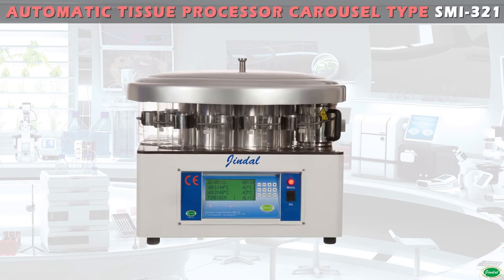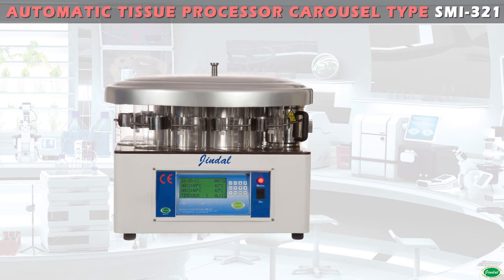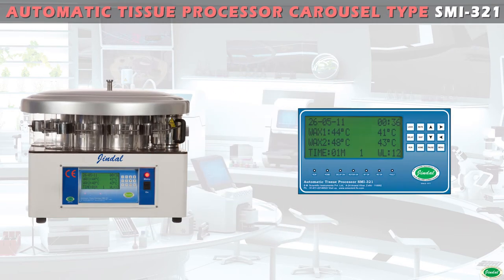Automatic Tissue Processor is a compact and sturdy instrument designed with the latest technology for complete automatic dehydration and infiltration of human, animal, and plant tissues, up to final fixing in wax. The precious tissues are subjected to continuous agitation by a rotating stainless steel tissue basket for thorough penetration of reagents.